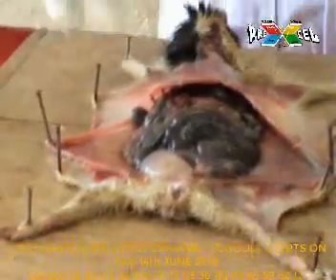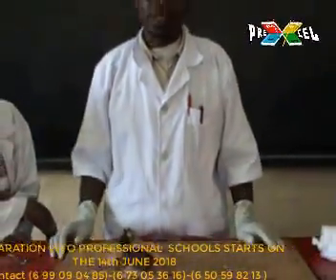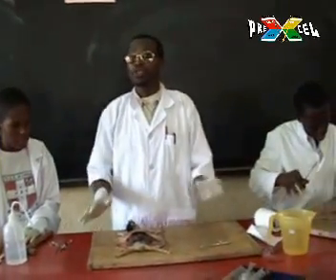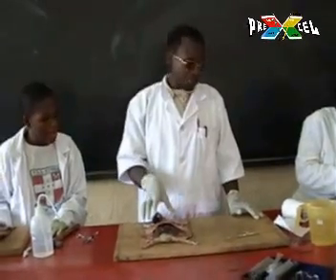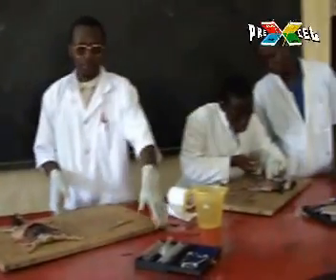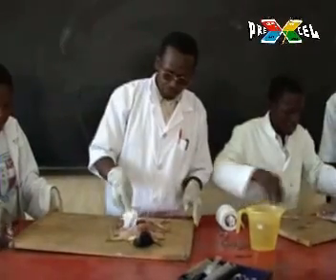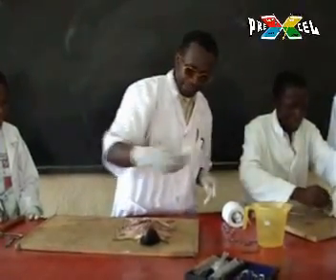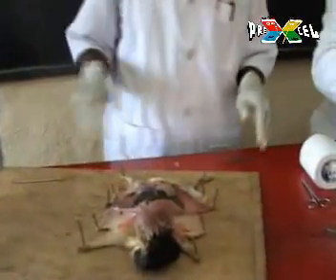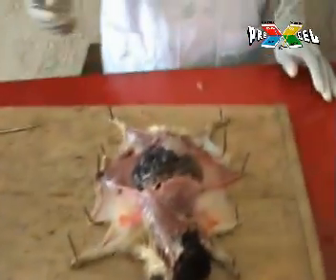Having pinned this and opened the abdominal cavity, the organism is now described as displaying the abdominal contents of the guinea pig in situ. If you are required to display the internal abdominal contents in situ, you just open them like that and leave it. This is the first stage — exposing the abdominal contents in situ. As these contents are in situ, you need to be able to identify the parts. Always remember to wet your dissections; if the dissection is not wet it will become dry and you may not see the parts well.